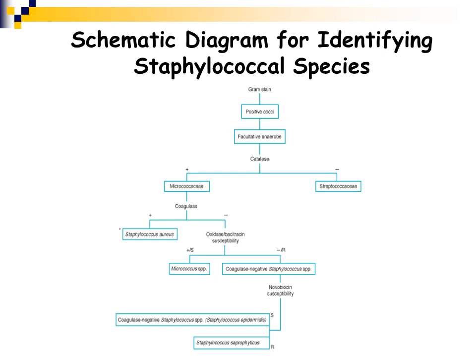If it is catalase positive, it's from the Micrococcaceae family, and it would likely be indicative of a Staphylococcus organism. The next thing you want to do after a catalase and you find it's catalase positive is to do a coagulase test. If it's coagulase positive, it is Staphylococcus aureus. If it's coagulase negative, you can do an oxidase test and a bacitracin susceptibility test.